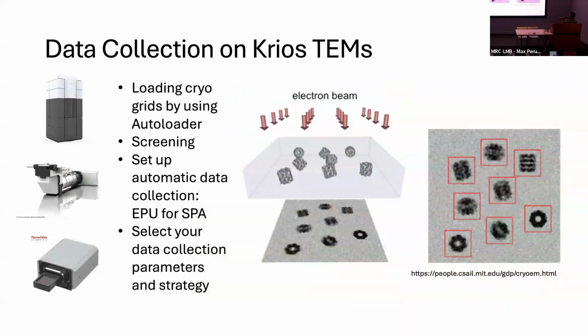So you will learn how to load the sample, how to screen the grid, how to set up the program we call EPU to automatically collect data, and how to select your parameters for the dose, everything for how to collect your data. This depends on what you want to see.